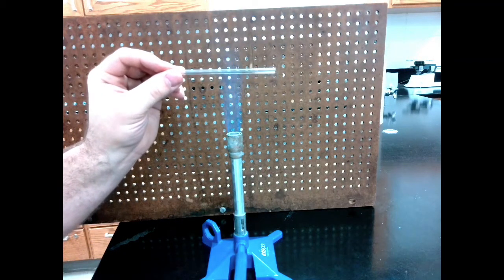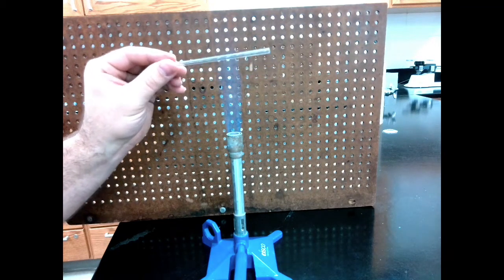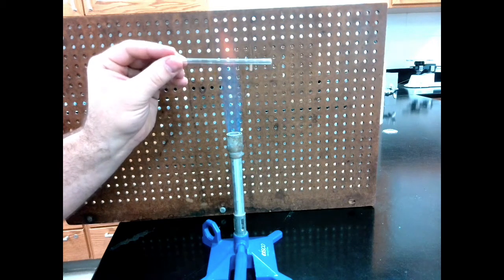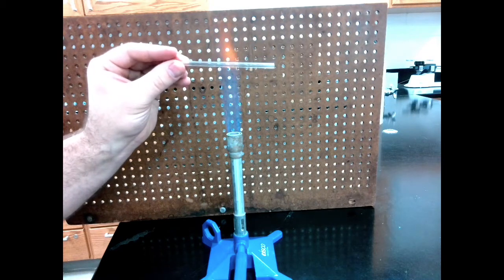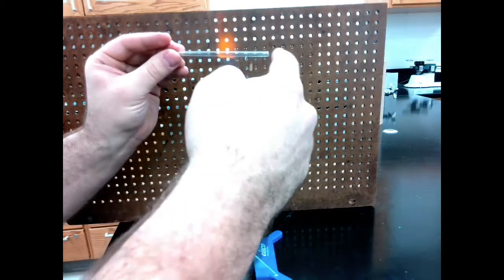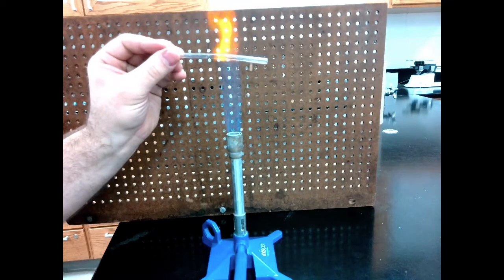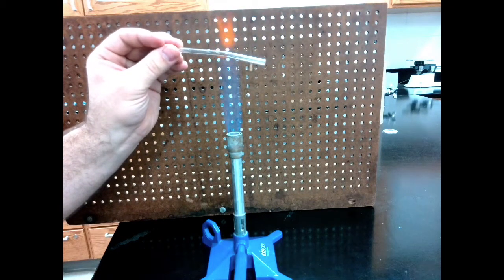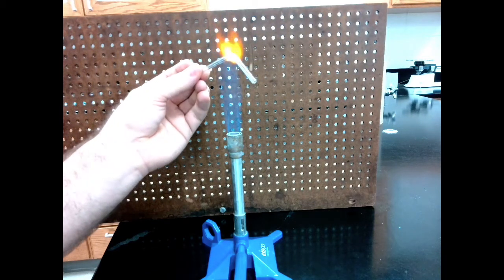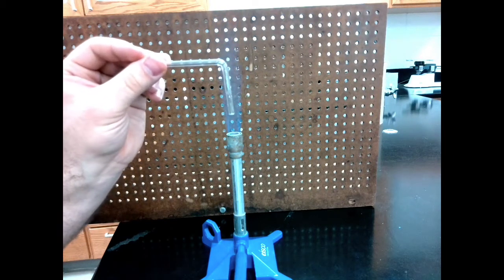So I'm going to put this in, and once again, I am rotating it right at the tip of that flame, right at the tip of that light blue cone. It starts to heat up. It starts to turn that orange color. And then I'll know it's ready because this end will start to droop down. Once that happens, that part of the tube will be soft enough to bend. Now I can just let gravity do its thing. It's coming down. I pull it out. Voila. I have a glass tube that is bent.